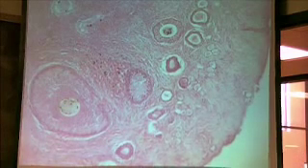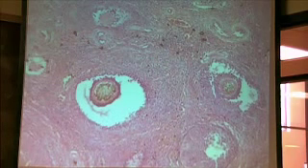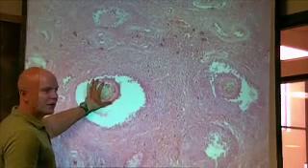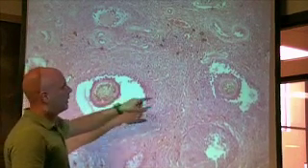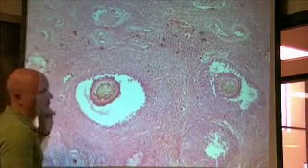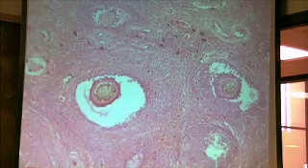And when that occurs, that's when we call it, so there it's starting to, that one right in the middle, but here we're seeing now that oocyte right here, it's pushed off to one side, we've got this space right here. Now this is a Graafian follicle. Alright? So it's no longer in the middle like what we see with this one. It's pushed off to one side. We could probably find some that's a little better than that. But let's look at this one here.